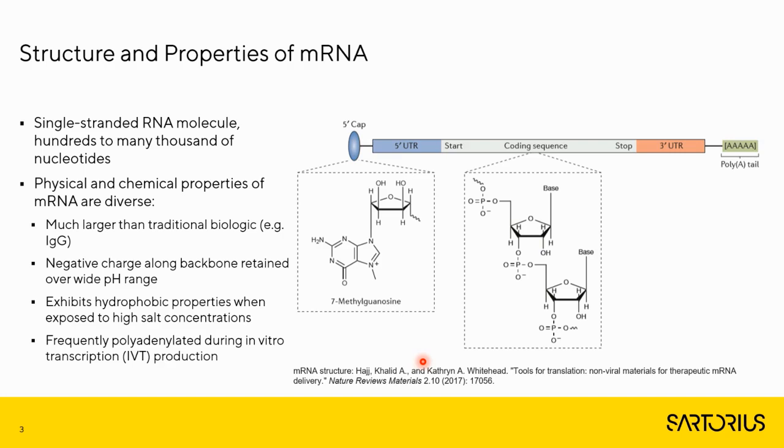and is the fact that for biological activity, mRNA and saRNA need to be polyadenylated. The fact that we have this long chain of adenines means that we can use complementary ligands immobilized onto chromatographic resins for affinity purification of mRNA. So those are the four key features which are important for all of the subsequent work, which I will define.